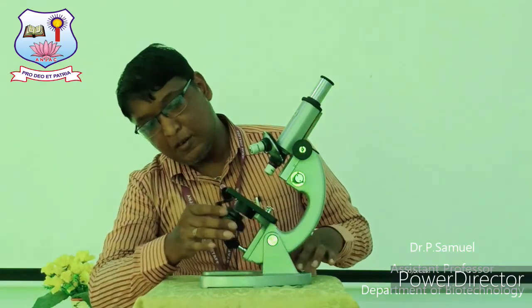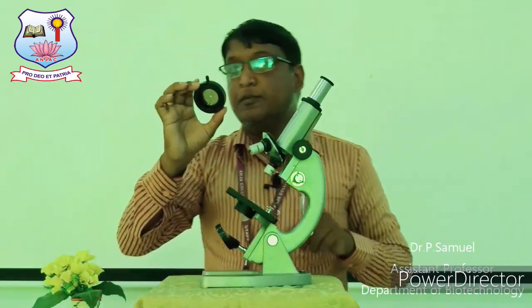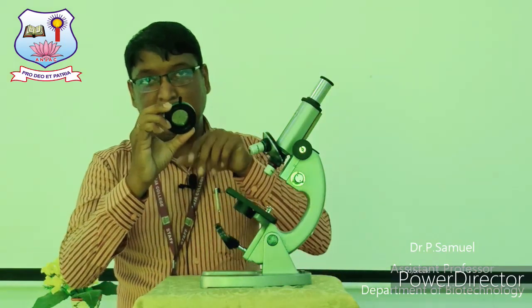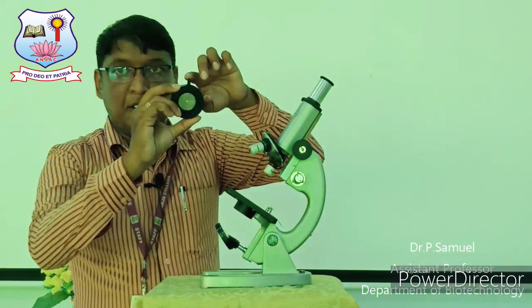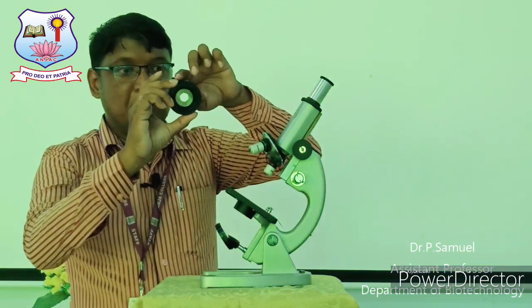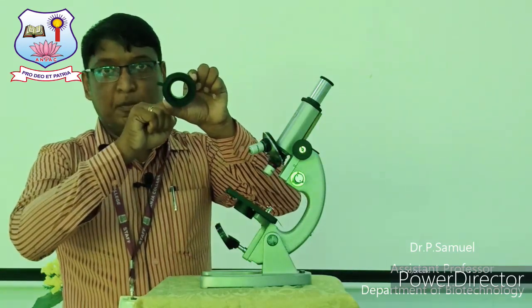And this portion is called the diaphragm. I told you, the diaphragm is the heart of the microscope, and it controls the amount of light entering into the axis, right? There is a knob here. You can adjust the knob to control the amount of light entering into the microscope.